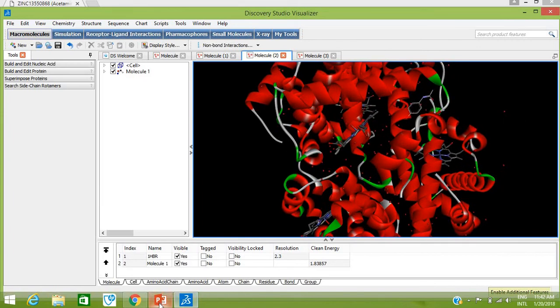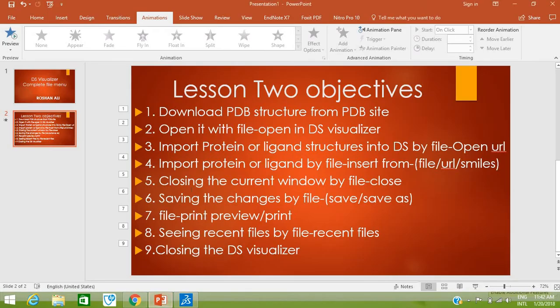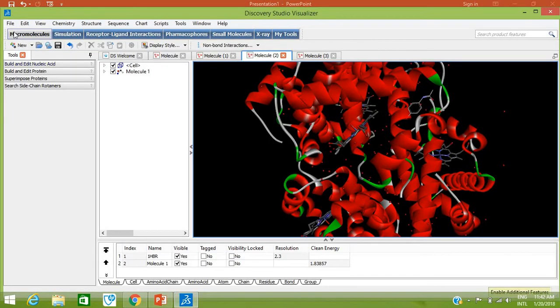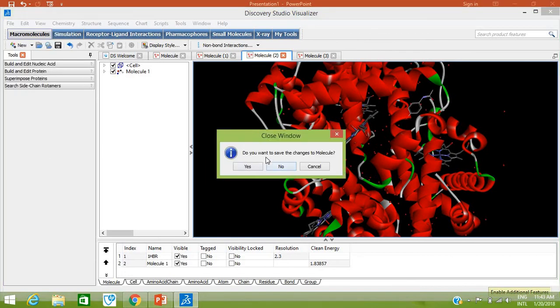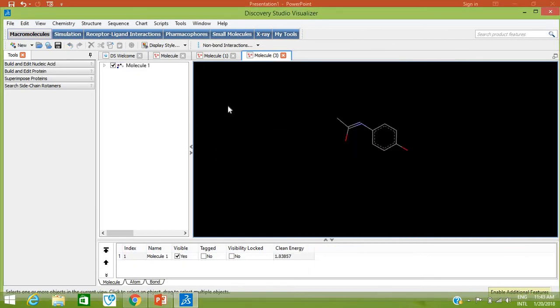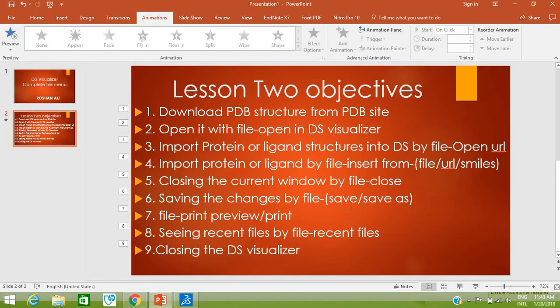Our next objective is closing the current window using File > Close. Go to File > Close and it will ask if you want to save the changes — you can say No. Only the current window will be closed, not the whole DS Visualizer.